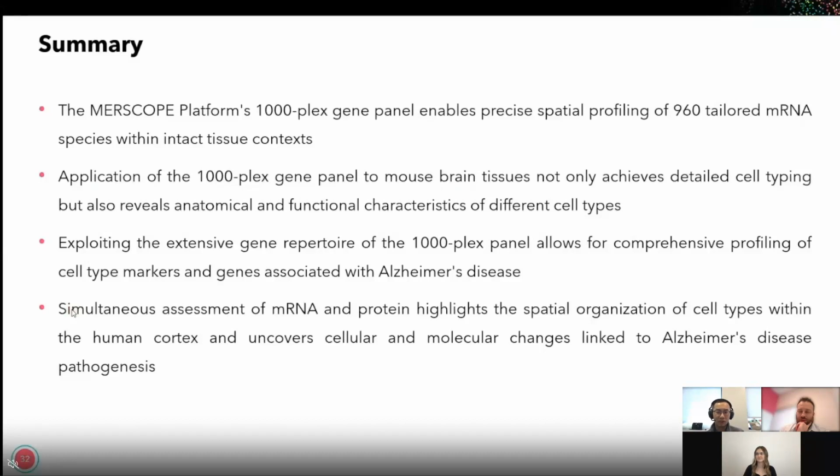Another way to think about this is, after you did clustering, if you think there are some spatial features that vary within a cluster, you can even go back, for example, to further divide this cluster according to the spatial information, and then further identify the molecular differences in these subgroups. That's really doable. For now, spatial genomics analysis is actively being developed, so probably more exciting algorithms will be generated to dig into the inside of this comprehensive data.